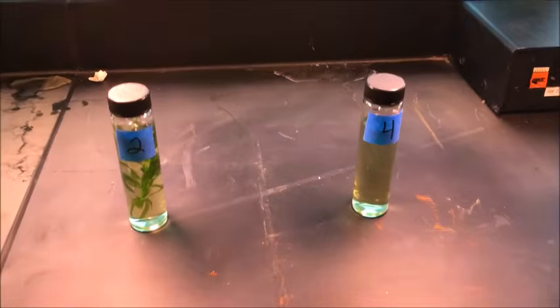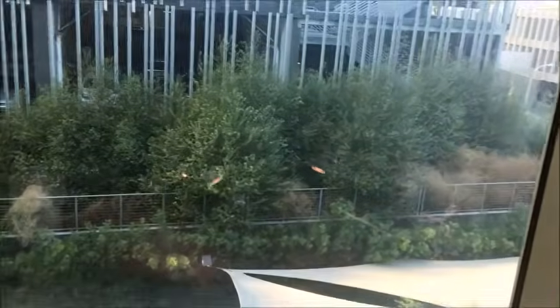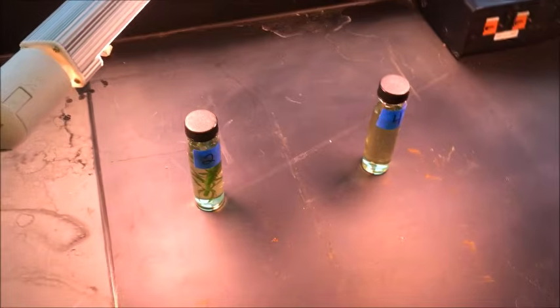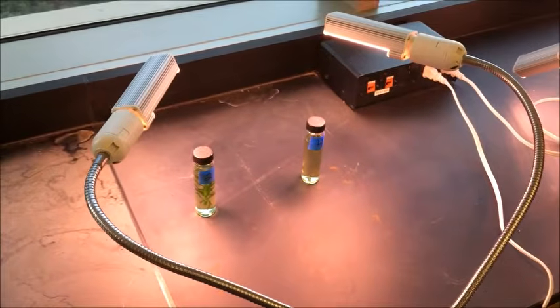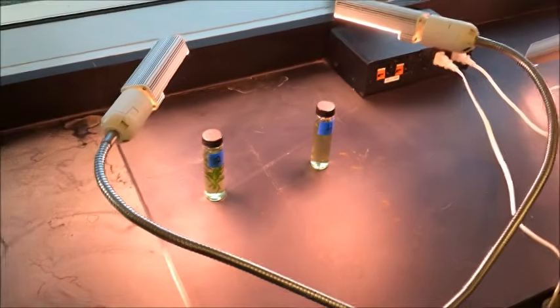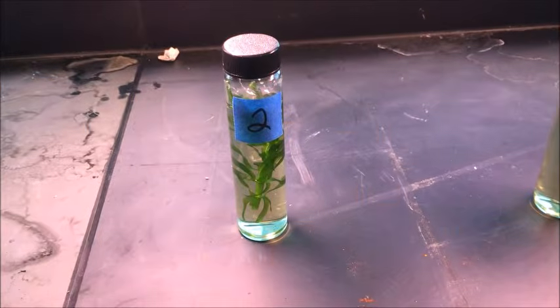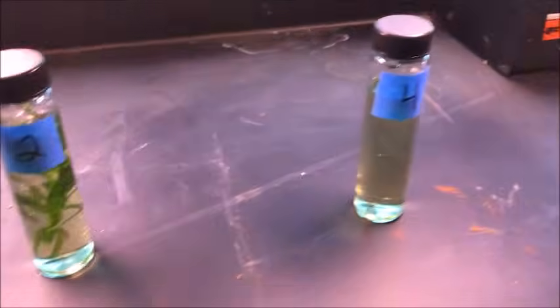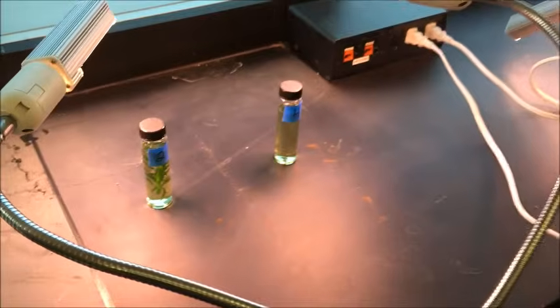Okay, so here are tubes 2 and 4. Not only are they right next to a window, so any sunlight that comes in, they'll be exposed to, but I also have them exposed to these two grow lamps here, these plant lights. So you can see tube number 2 has the water plant Elodea in it. Tube number 4 does not. And I'm going to let them sit for 24 hours.